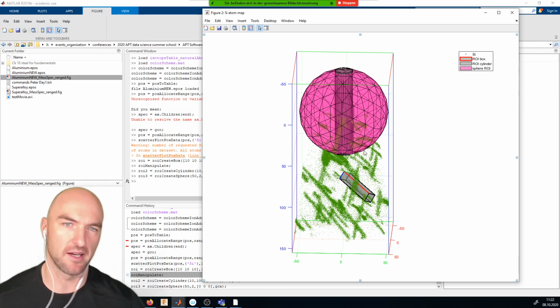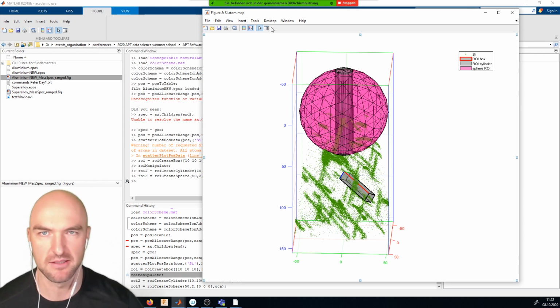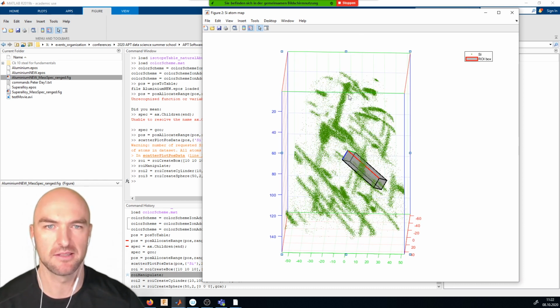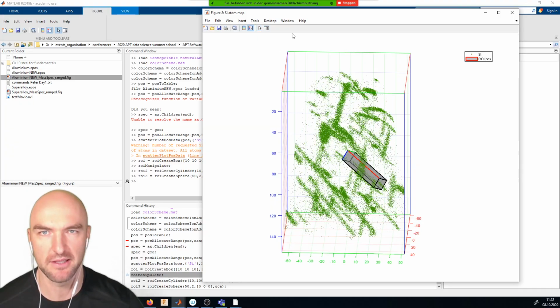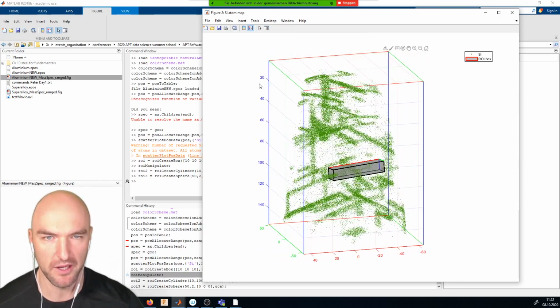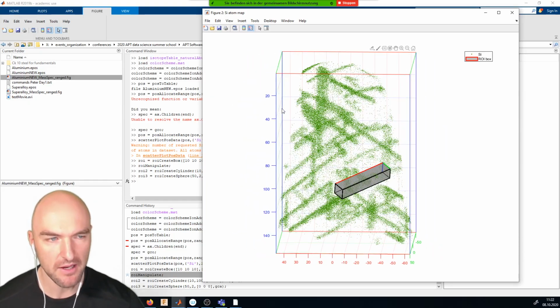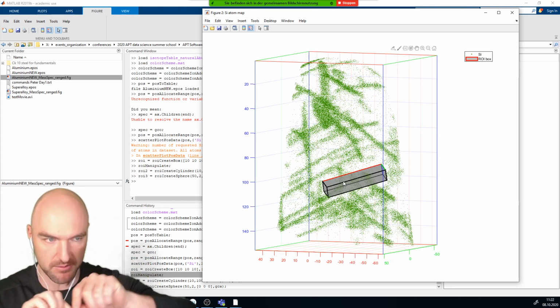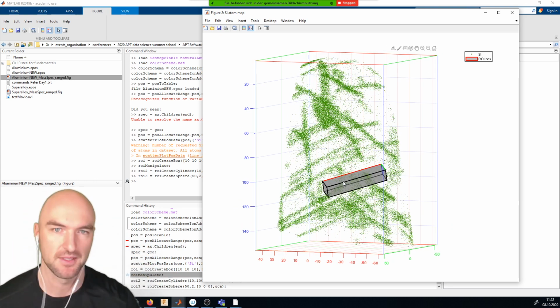And this could, for example, be some kind of analysis setup. Obviously, in our case, we can just delete the cylinder and the sphere because we don't really need them. That's not what we're after. What we want is looking into this thing here. So the next thing that would interest us, obviously, is, and for the sphere, obviously, the coordinate system 0 is in the middle of the sphere. Right.